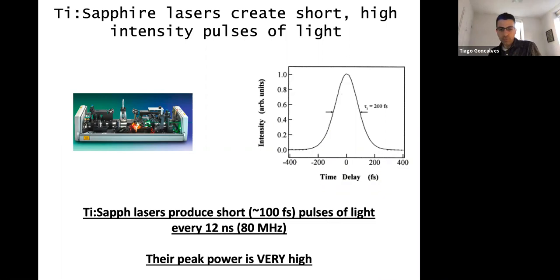And in the late 80s, early 90s, the first lasers that were practical to use this technique in microscopy were made available. These are titanium sapphire lasers. These are relatively clunky and complex. It's actually a laser cavity with a pump laser attached, and they have moving parts inside. You always need to tune them, and they're relatively big, expensive, and complex.